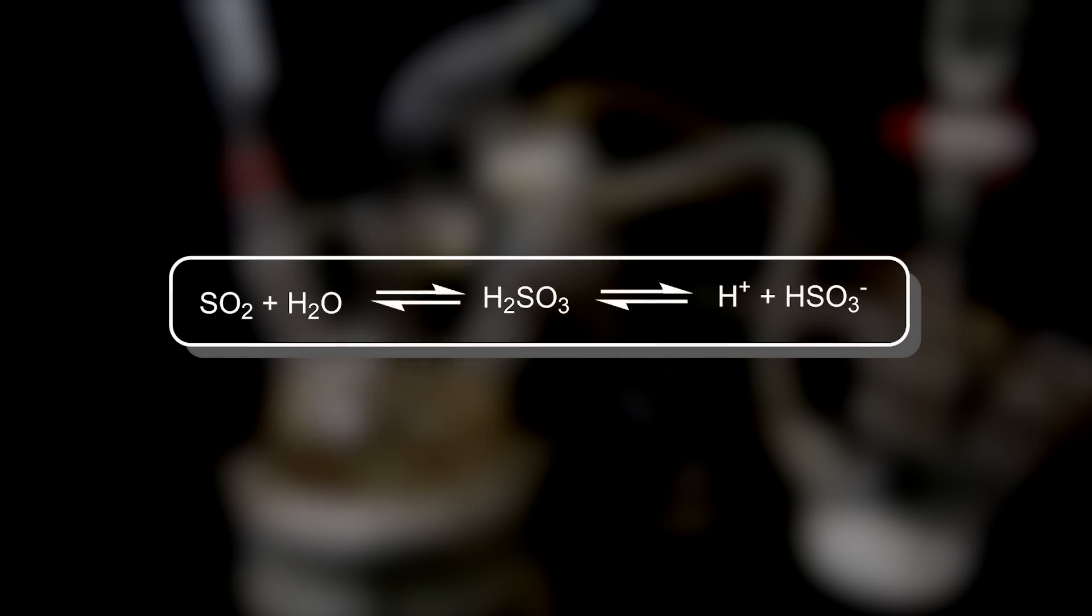In more detail, first, sulfur dioxide reacts with trace amounts of water that is present in the ethylene glycol, as well as pretty much every solvent, to form sulfurous acid. Sulfurous acid does not exist in its free state and dissociates into a proton and a bisulfite ion.